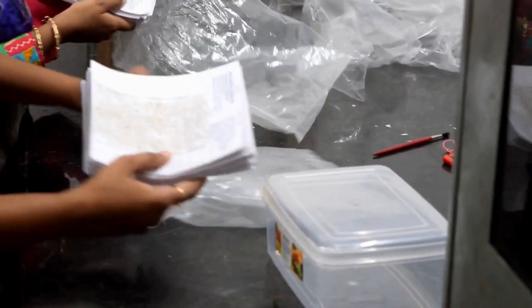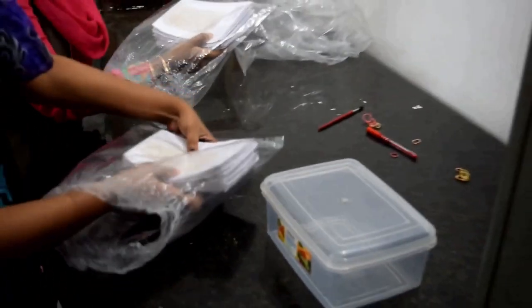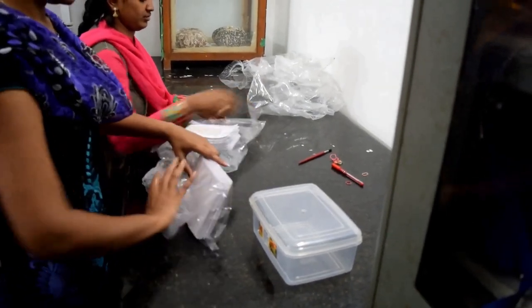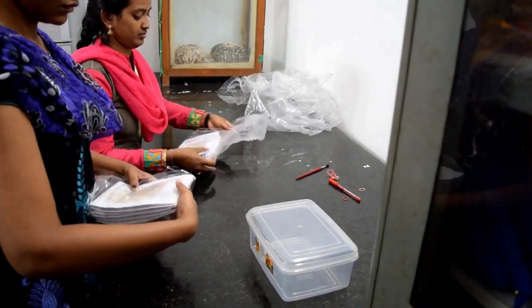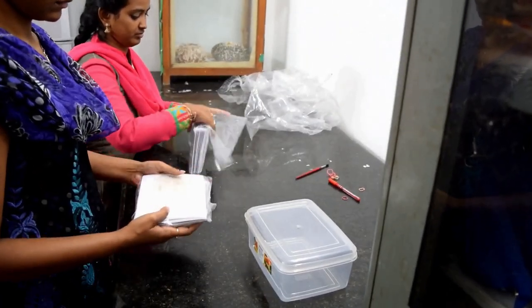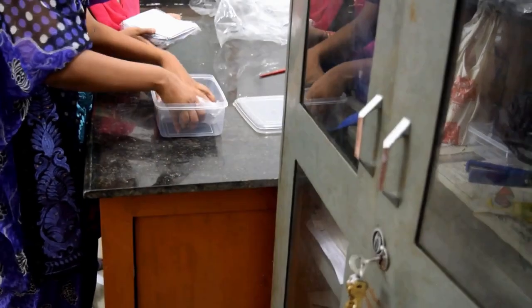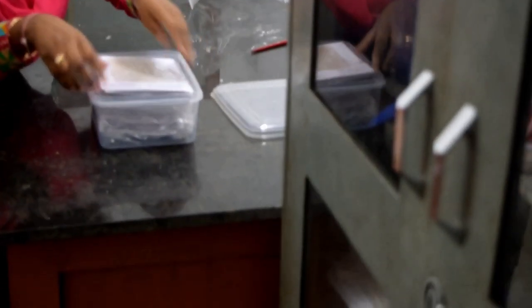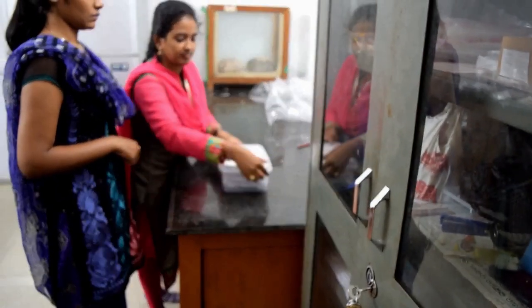These bags are kept in plastic boxes and stored in refrigerator at 5 to 10 degrees centigrade. The cards can be stored in refrigerator for a maximum period of 4 weeks. Within this period, the inoculum cards are used for rearing and the trichocards are applied in the field.